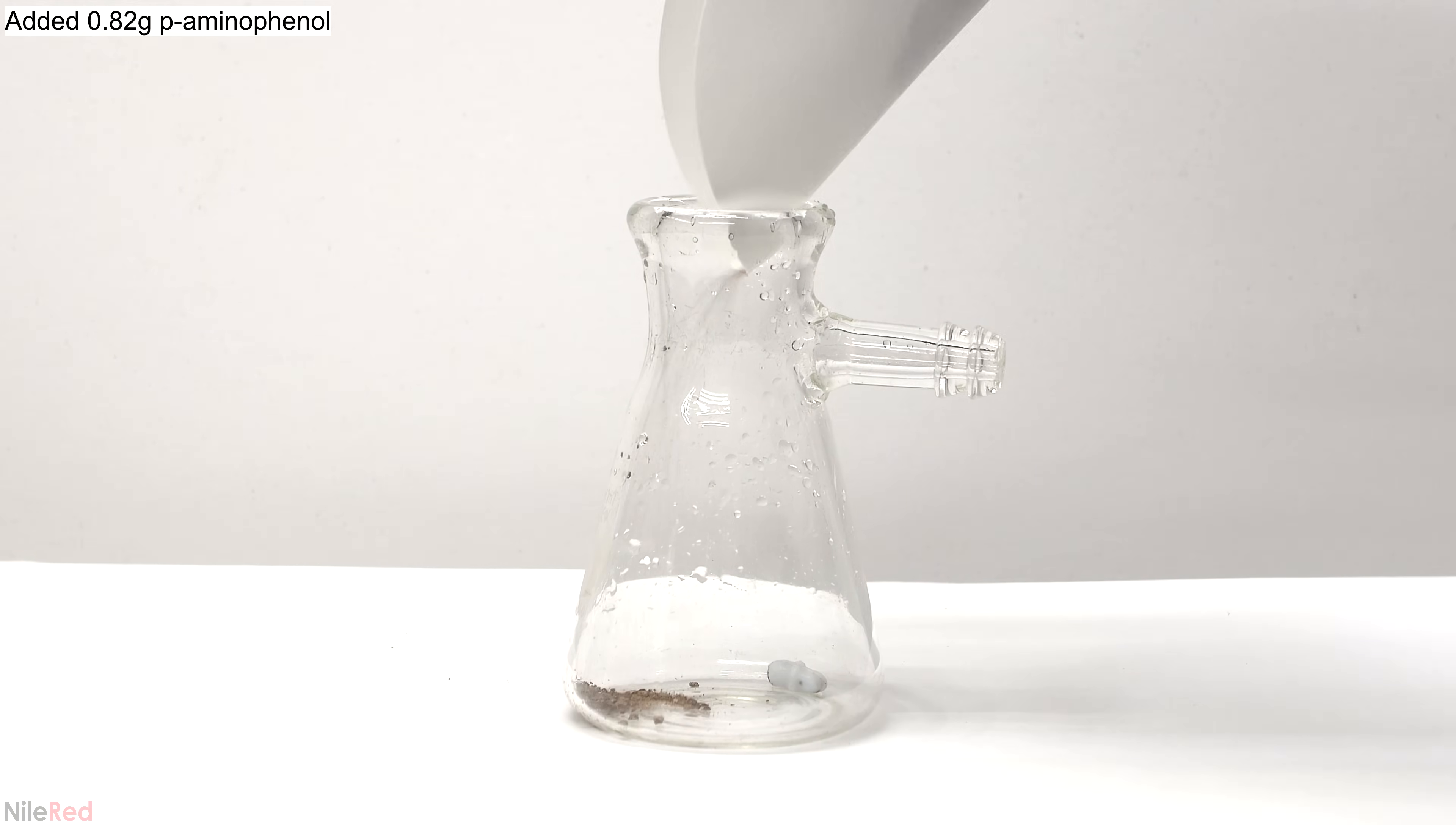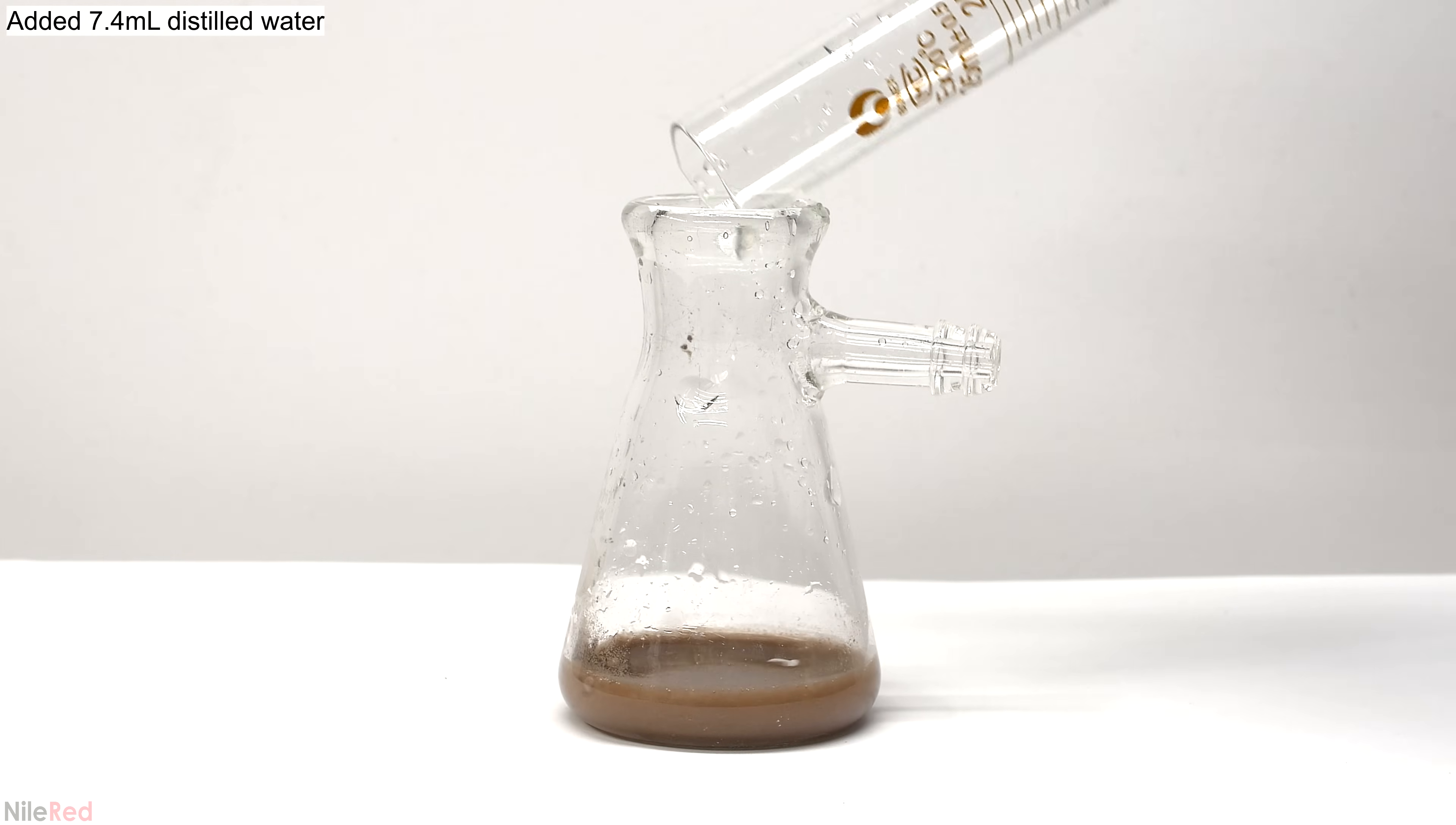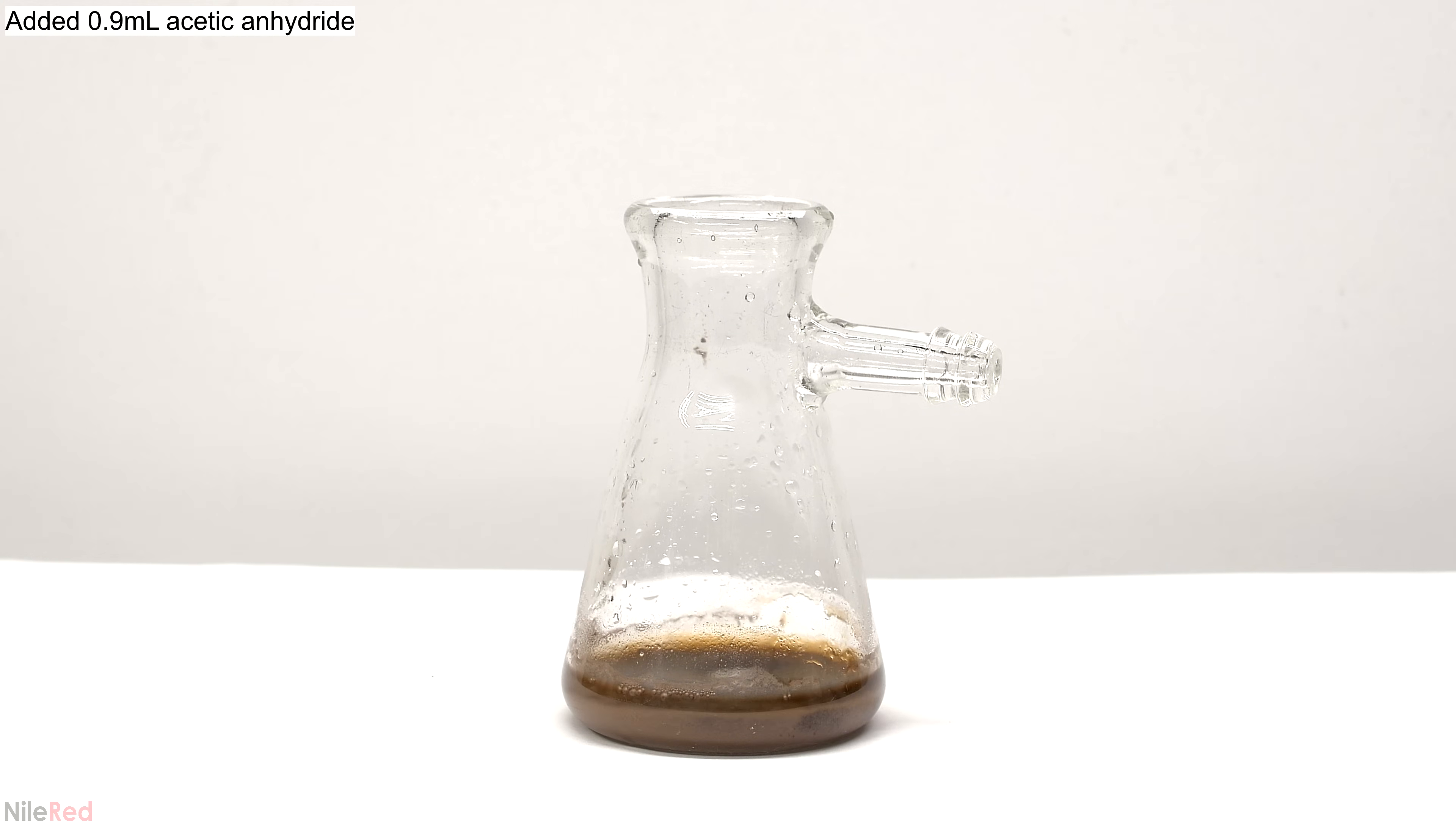To start things off, all of the p-aminophenol was added to a flask along with a little bit of water. P-aminophenol is not very soluble in water, and what we want is an evenly mixed suspension. Once I had a nice even suspension, I added the acetic anhydride. After it's added, the p-aminophenol should quickly dissolve.